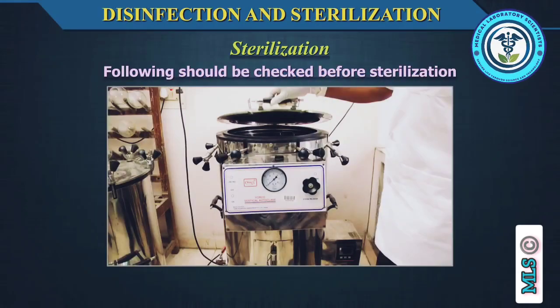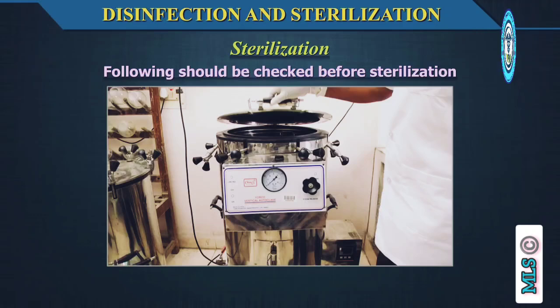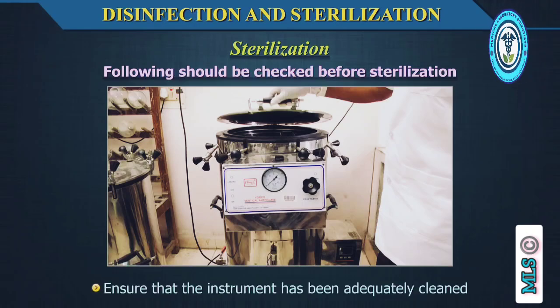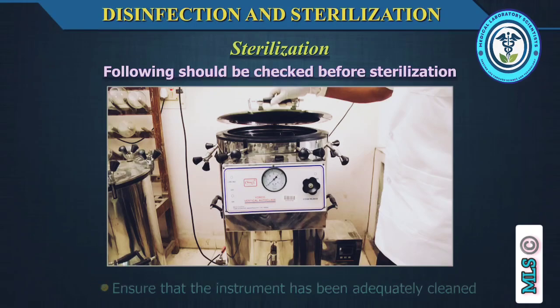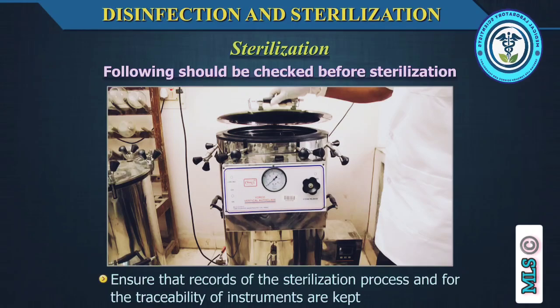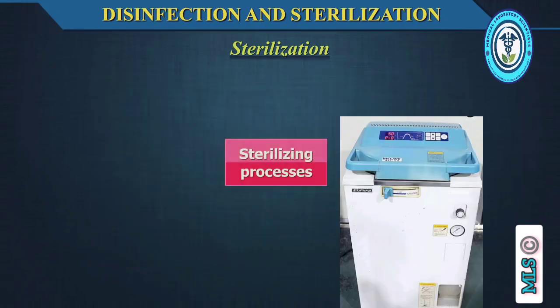Before any instrument or equipment goes under the process of steam sterilization, the following should be checked. Ensure that the instrument can withstand the process, for example, steam under pressure. Ensure that the instrument has been adequately cleaned. Ensure that the instrument does not require any special treatment. Ensure that the records of the sterilization process and for the traceability of the instruments are kept.